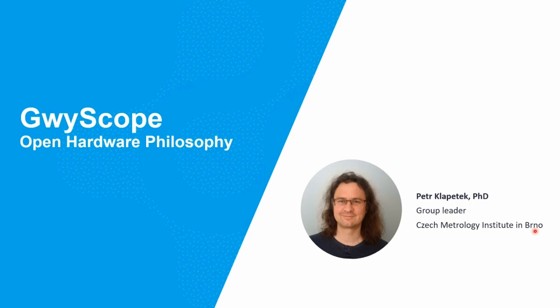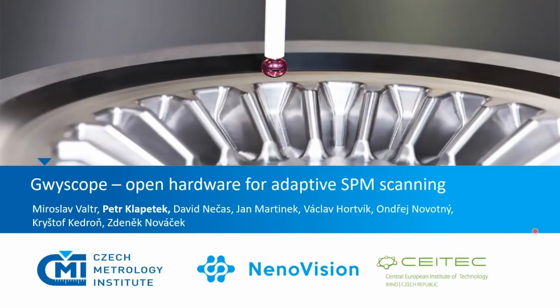Okay, thank you. Hello again. I'm Peter Klapetek from the Czech Metrology Institute, and I would like to talk about the open hardware digital signal processor that is inside the LiteScope 2.5.